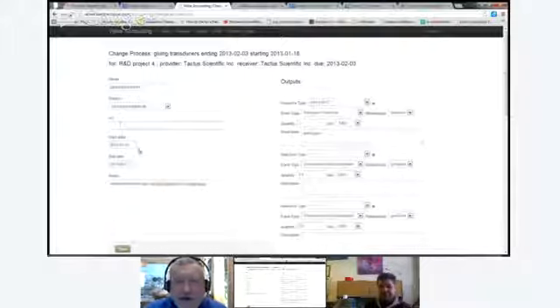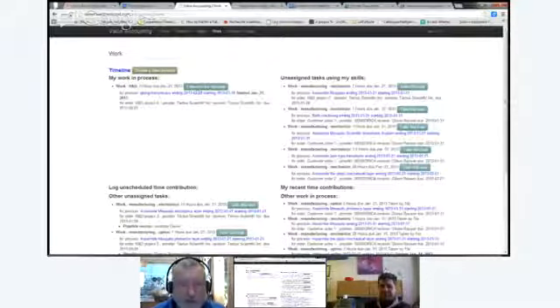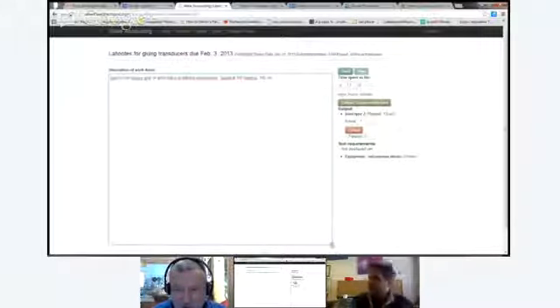Yeah, and there's a big text area there, and there's a URL, so you can link all over the place to external pages. The lab notes page has a big text area that you can add to. There's a thing down on the lower right where you can extend it and make it bigger. Yeah, right.